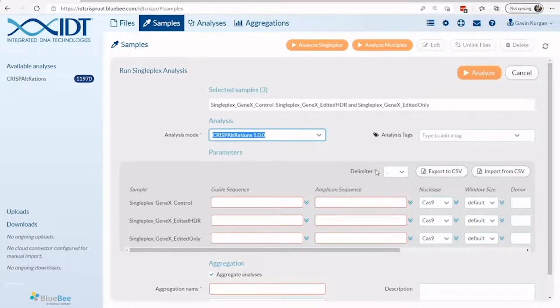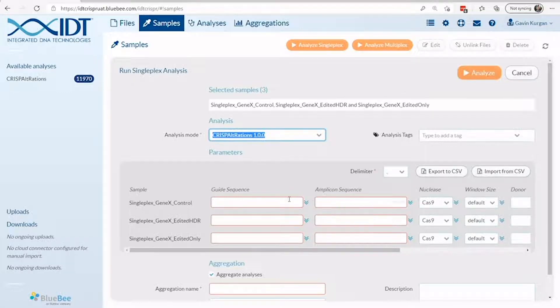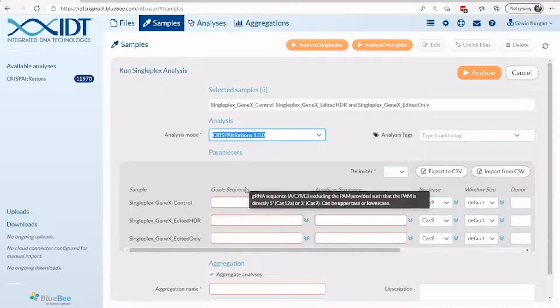To start a run, you need to supply the information highlighted with a red box. This includes the nucleotide sequence for amplicon and guide sequences, 5' to 3', excluding the PAM.